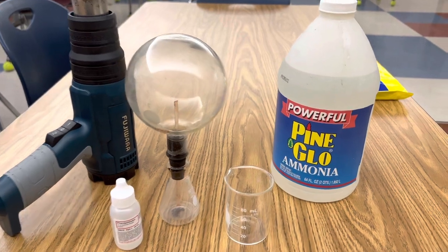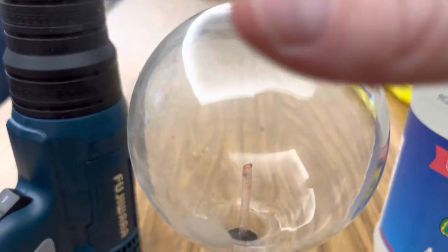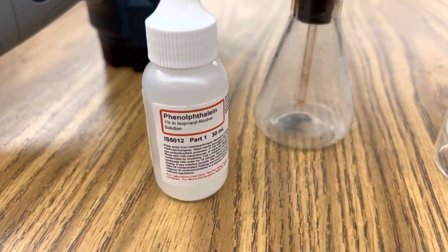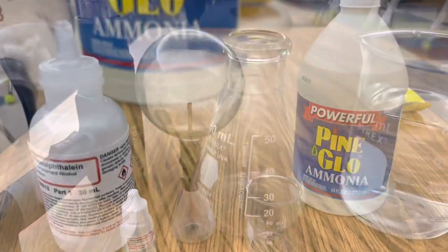All you need for this reaction is some ammonia, a beaker with some distilled water, a flask that has another flask attached to the top of it, a couple of stoppers, some phenolphthalein as an indicator, and a heat gun or a Bunsen burner to heat up your ammonia.